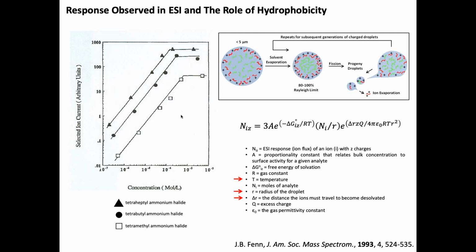So when you think about competition for ionization in an LC-MS experiment, it really comes down to what's in there competing. So then it gets to not just hydrophobicity, but also chargeable groups. And heparan sulfate has a whole ton of those. So you would probably have a lot of the same species in a droplet, is what you're saying? Depends on the sample, yeah.